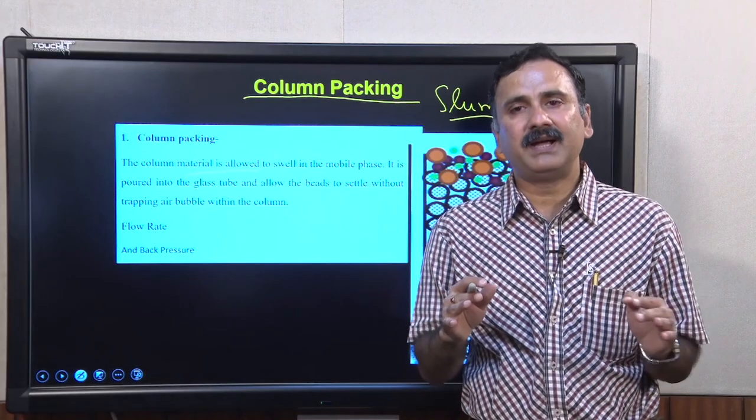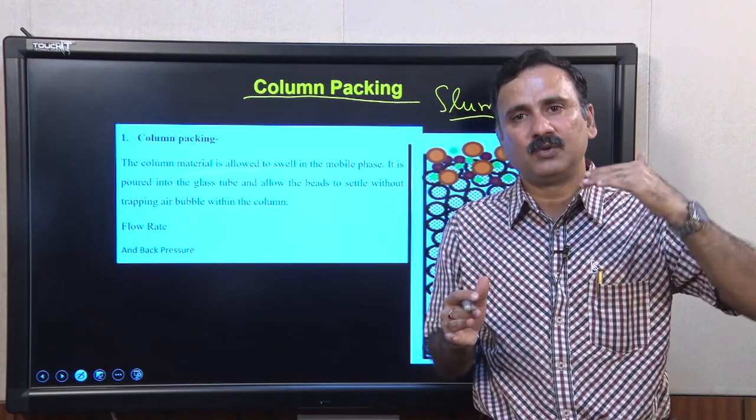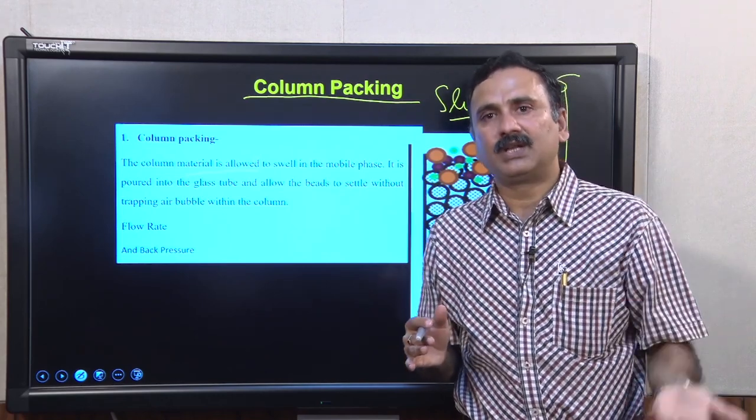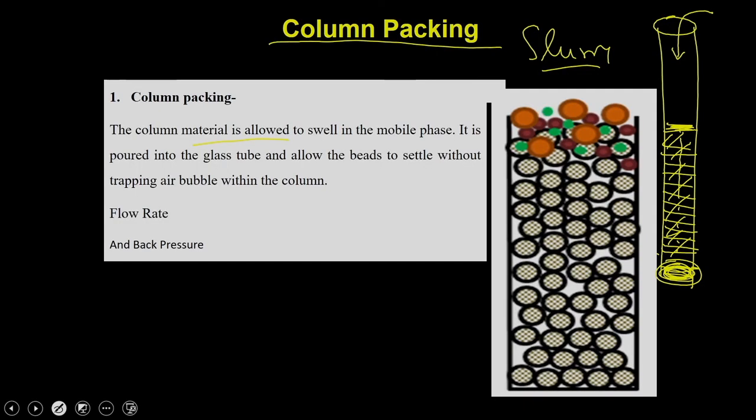And this arrangement has to be homogeneous. There should be no breaking or discontinuity, because if there is a discontinuity, it is going to hamper the running of the samples. Now ultimately the whole column is going to be filled with these beads and your gel filtration column is going to be ready.